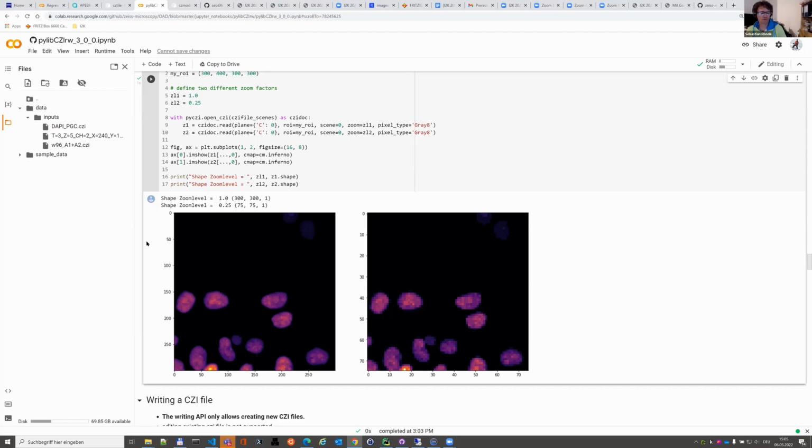But if you say it would be super great, Jean-Yves, okay, good to know. Okay, point taken. In the end, it's about in what amount of time we can do what. But imagine, also in Zen, pyramid levels are either going with a factor of 2 or 3. So it would be quite easy to basically achieve the same thing here.